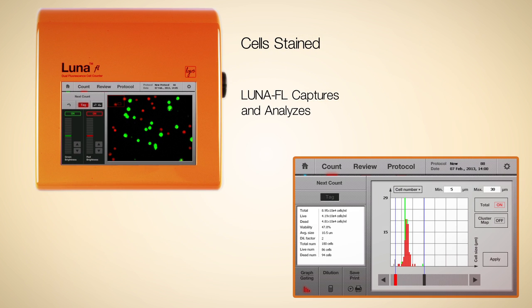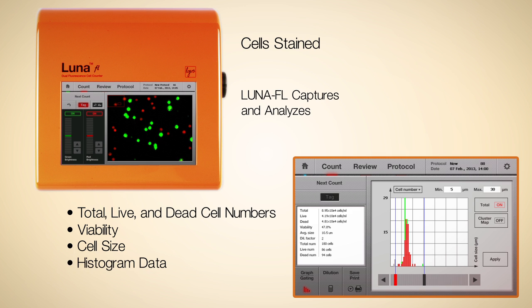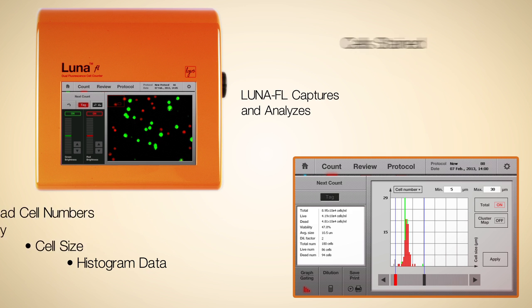Within 30 seconds, total, live, dead cell numbers and concentrations, viability, cell size, and histogram data are displayed on a touch screen LCD monitor.